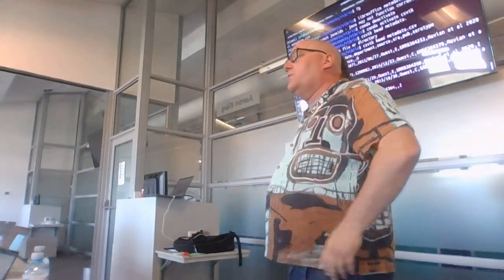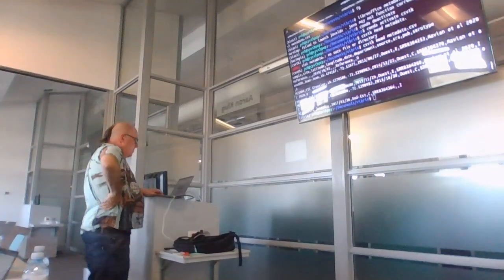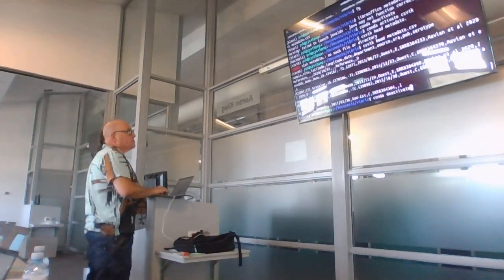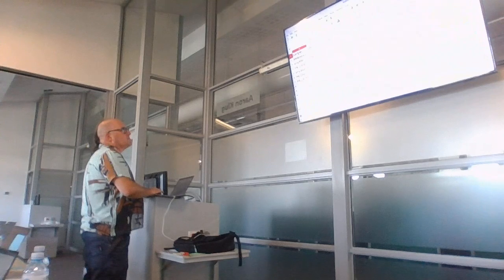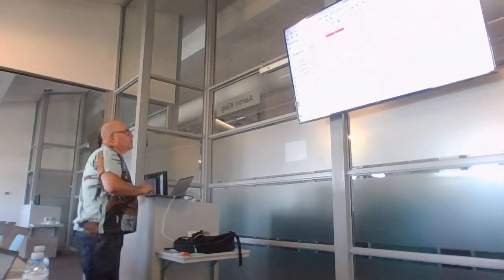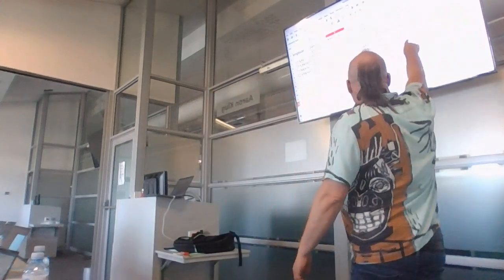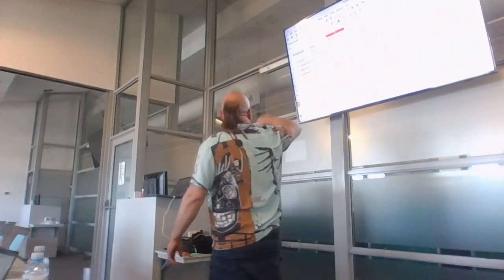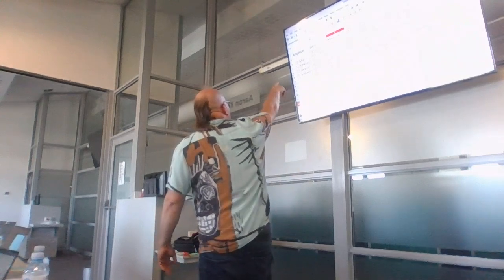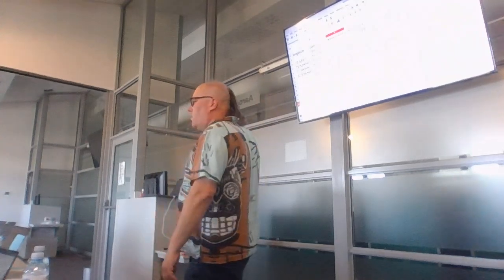And what you'll see if you look at this, leaving aside MicroReact, in LibreOffice, what we notice when we look at the dates of the Ogawas and the Inabas, is that the Inaba samples are collected in 2015 and 2017. Here, towards the end of 2015, and then 2017, and the Ogawas are collected at earlier dates.